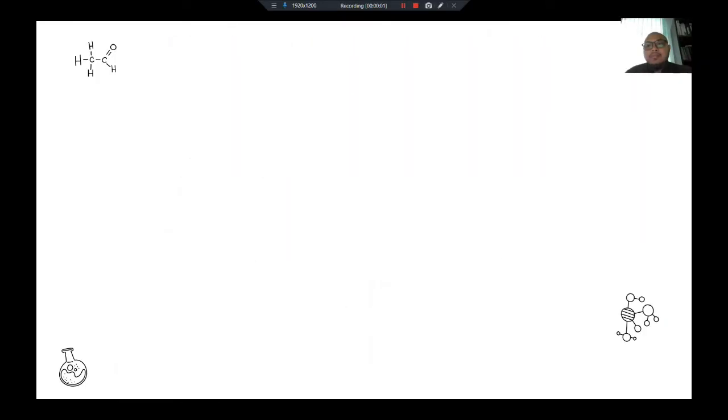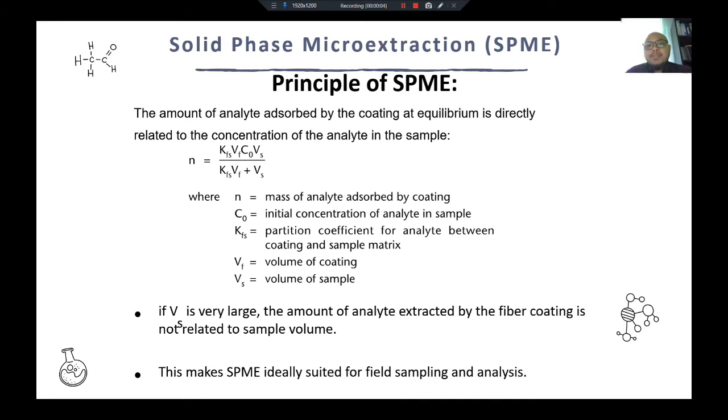Okay, let's continue. Okay, here is the principle of SPME.